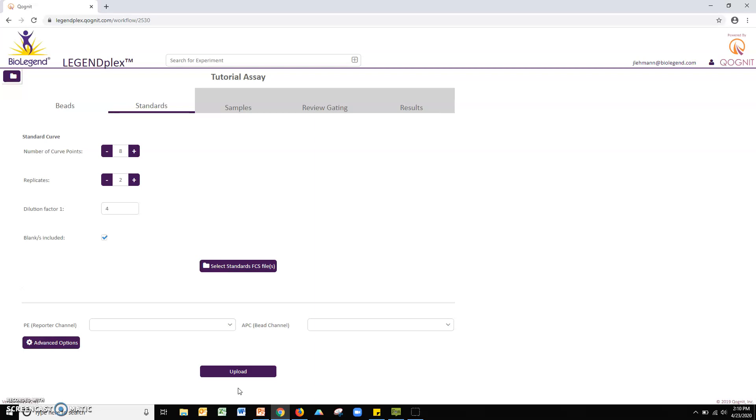If required, adjust the parameters at the top of the screen to match your assay. Note, the default settings match those described in the LegendPlex assay manual and typically do not need to be adjusted.